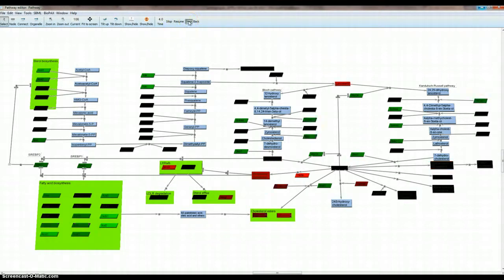We step again, step again, step again, step again, and then suddenly when the gene expression level of the DHCR7 has gone back to 0, then this level is going up. And DHCR24, sorry, I thought that was acting on the desmosterol. I guess they do have it there. That's going down, and then there's no change here.